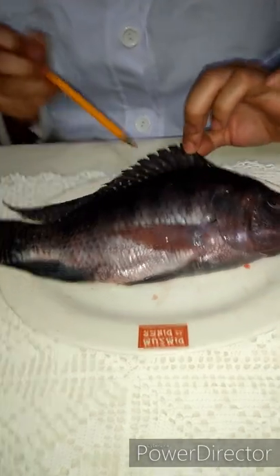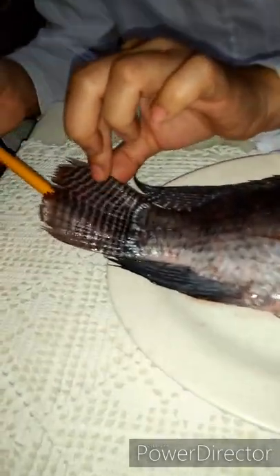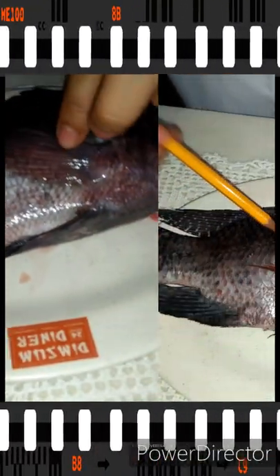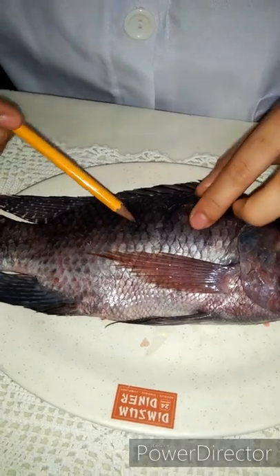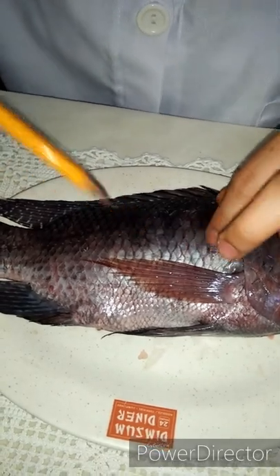such as the dorsal fin — this one is the dorsal fin — the caudal fin — this one is the caudal fin — and the anal fin — this one is the anal fin. And the paired fins, which are the pectoral fins and the pelvic fins. This is the scales of the tilapia; this is a cycloid scale.